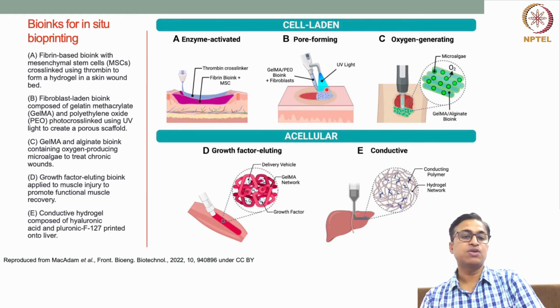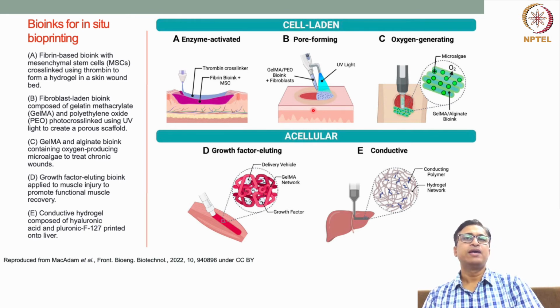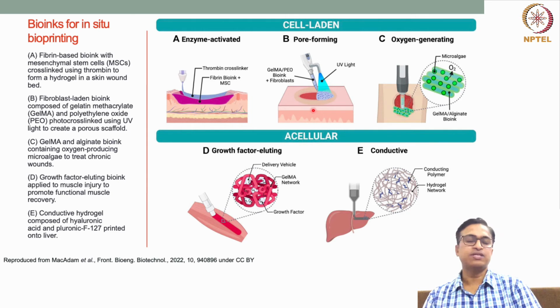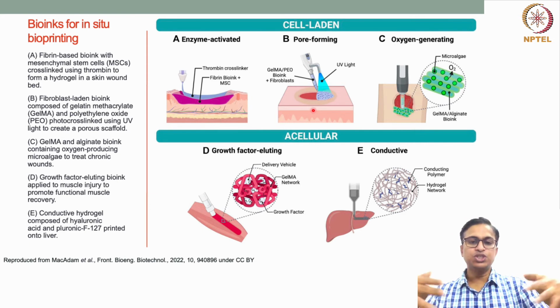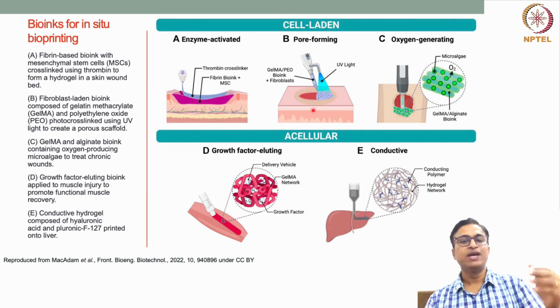So this technology can be very well used whenever we are trying to bioprint a construct with some porosity, and porosity helps for different applications, like cell migration, nutrient transport, and also these pores can be available for new tissue growth. The tissue ingrowth happens from the surrounding native tissue, and at that time these pores can become handy.